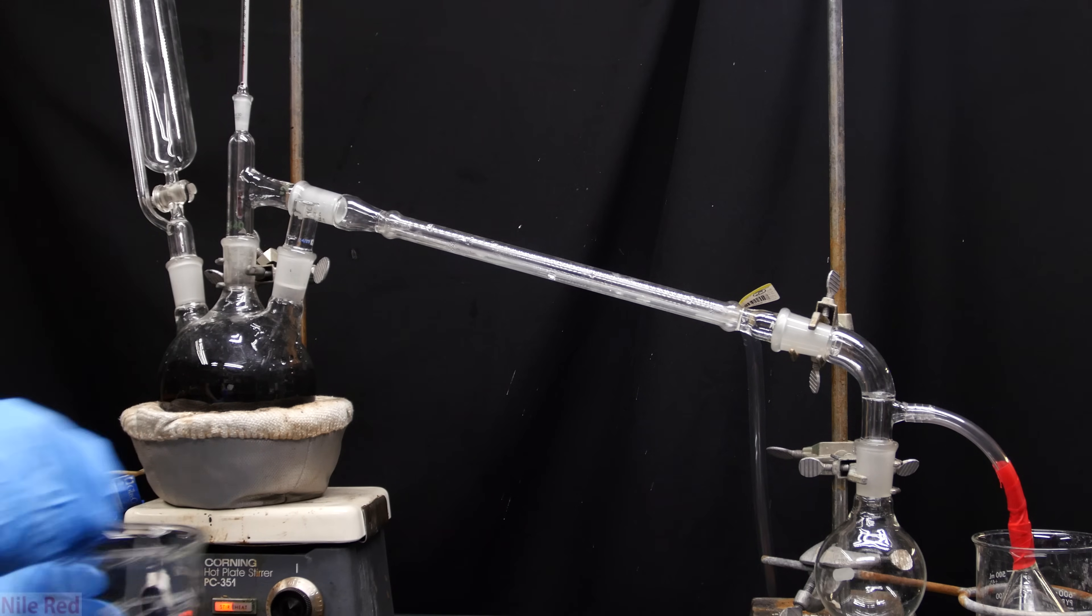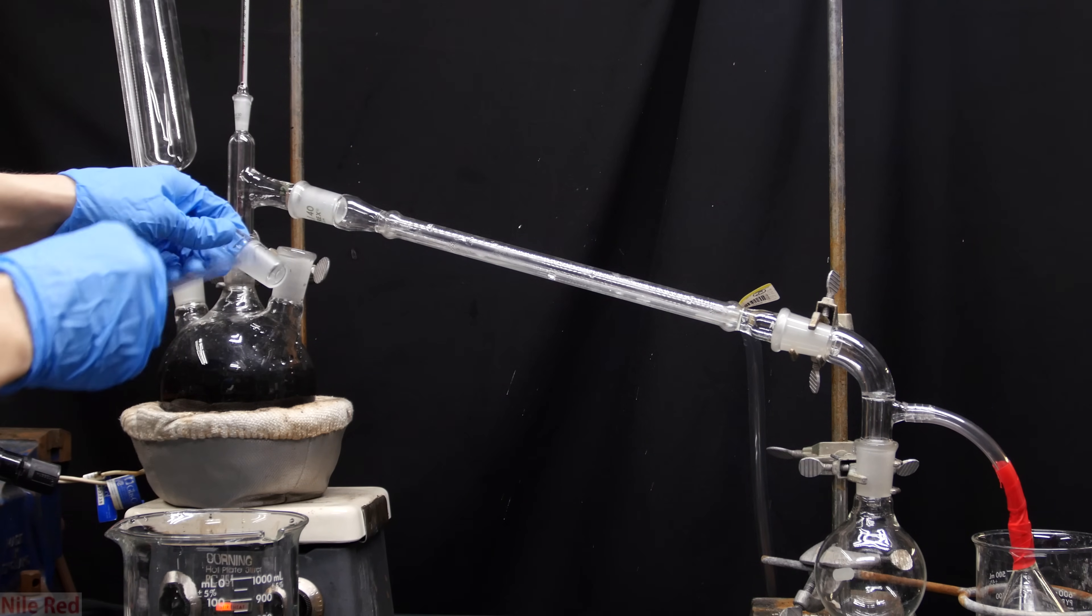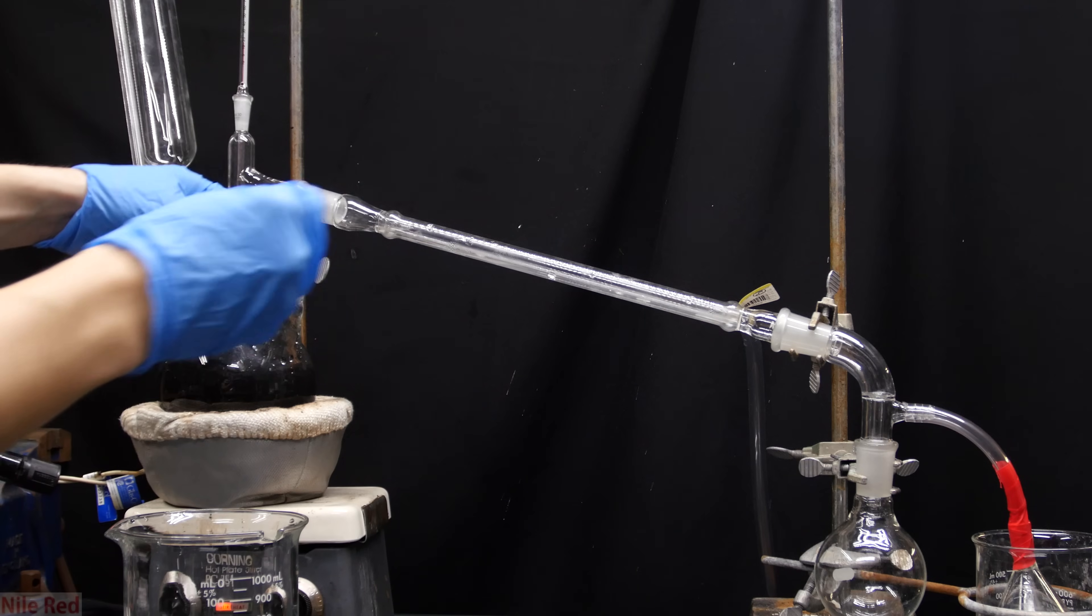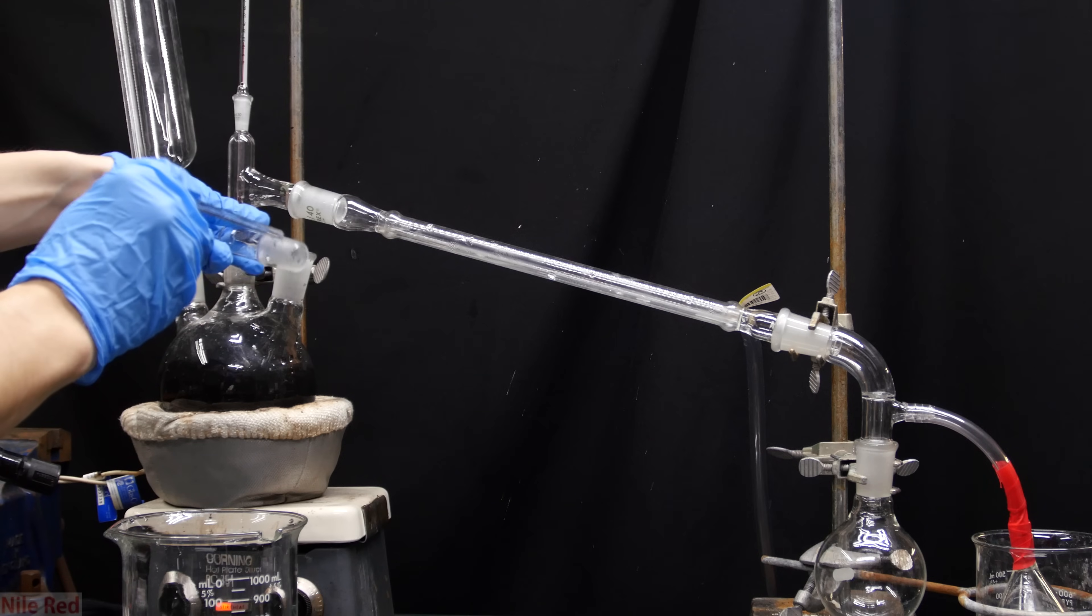You can see here the final setup of the simple distillation that we'll be carrying out, and I start lubricating all of the joints with a little bit of sulfuric acid. When making bromine, I think sulfuric acid is the best sealant to use for the joints.